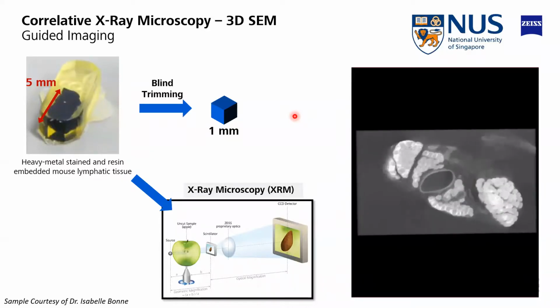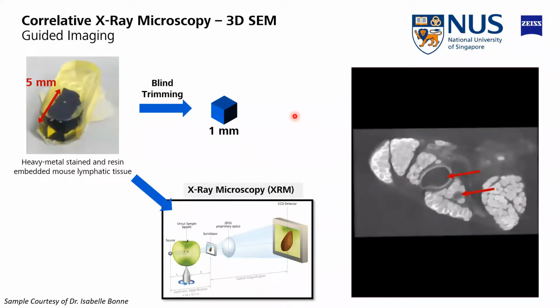And again, we wanted to see lymphatic vessels. And I thought, this is great. I mean, I can see it. It's running right from the top to bottom. I looked at the data, and it was very clear to me that this is the one. But at the same time, I also acknowledge I'm a neuroscientist, not somebody who works in the lymphatic or blood vessel system. And the researcher actually came back to me and said, well, this is actually a blood vessel. That's not a lymphatic vessel.